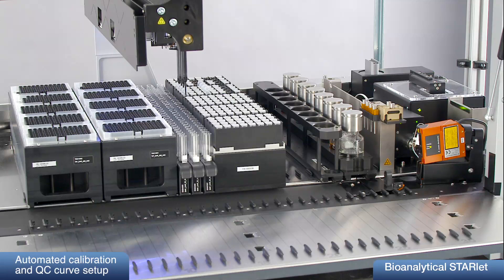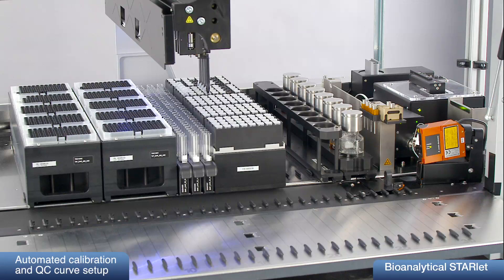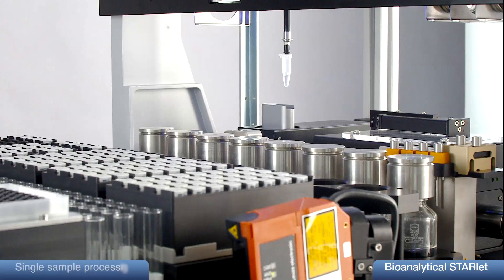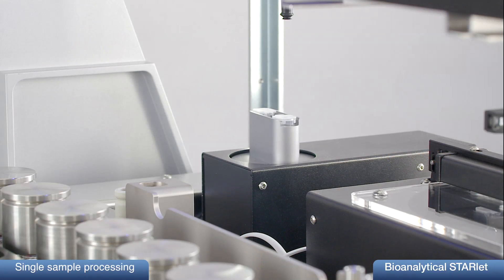Calibrant solution will be diluted 1 to 50 with blank matrix to ensure a similar behavior as real sample. Finally, the calibrants, QC probes, and samples are processed one after each other.